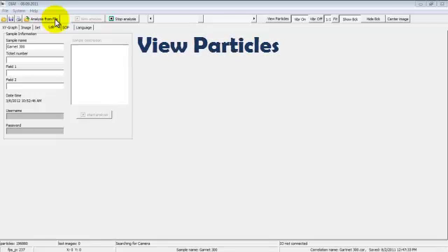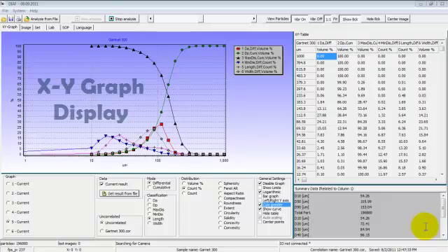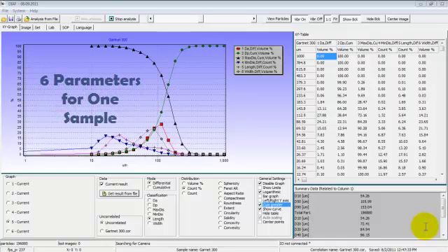While re-running the video file, you can view the particles being measured or view the graphical distributions building, exactly as you can do when measuring a new sample. This is the XY graph display, where both graphical and tabular size and shape distributions can be displayed for any of the 24 different parameters measured. Here we're seeing the results of six different size parameters for one sample.